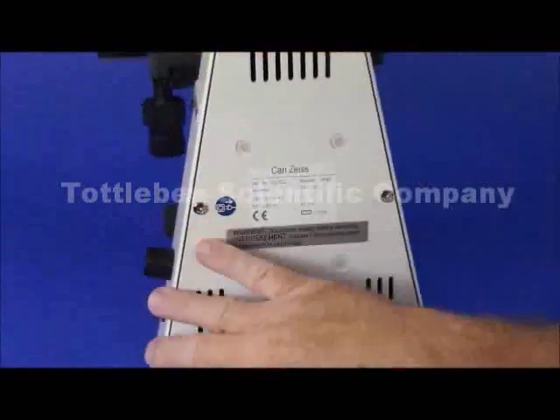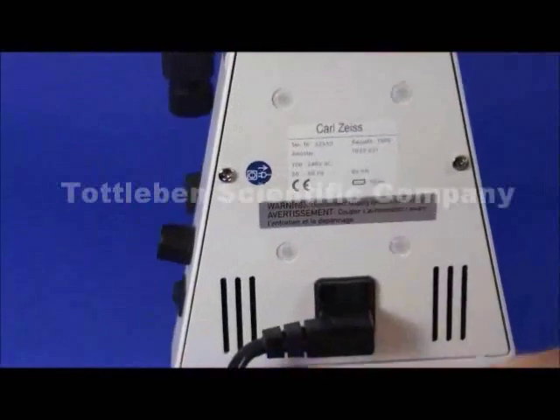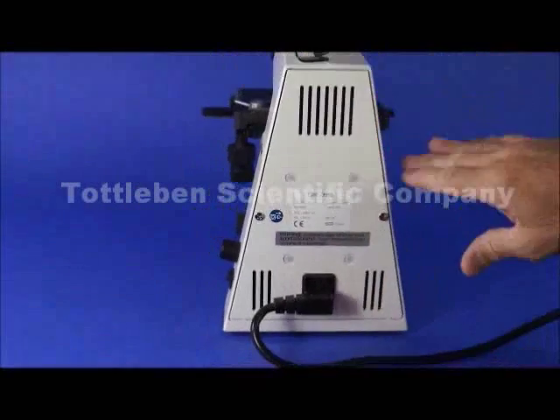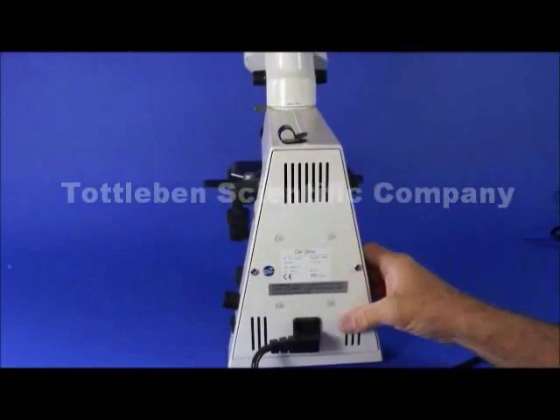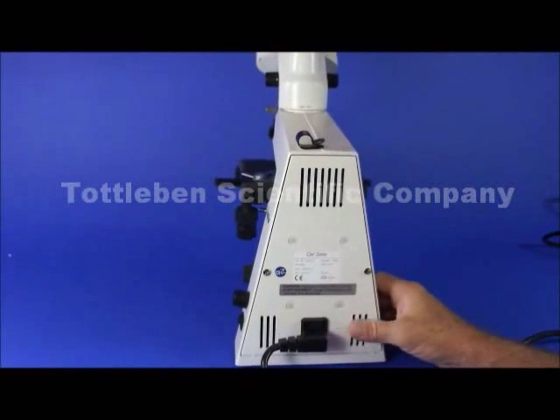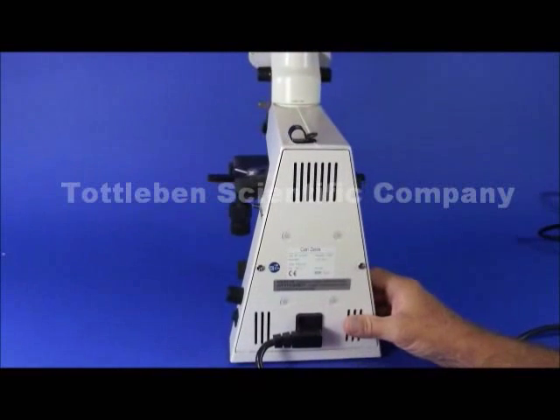Zeiss was the first company that came out with the triangular shaped pyramid design and now all the companies are doing it but they were the first. They innovated it and it's a very nice design, very nice scope. This is a well-built scope built to last probably 15-20 years easily.